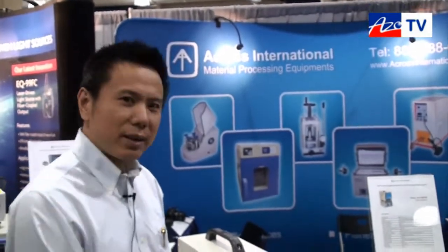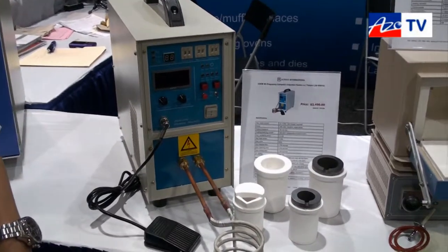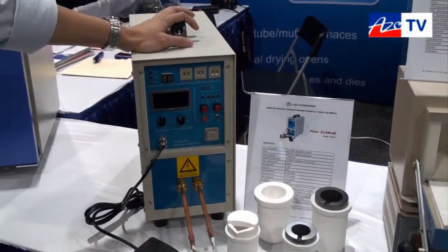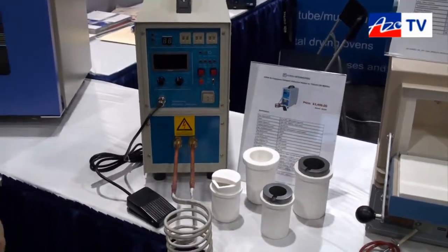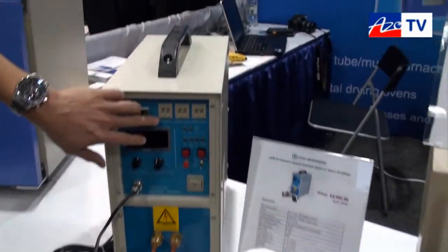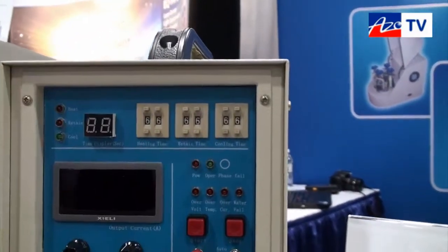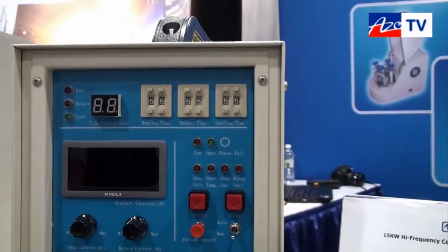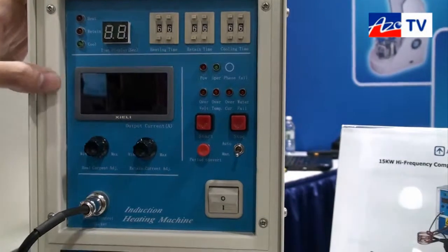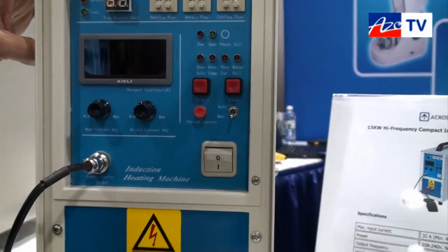This induction heater is for melting, welding, and surface heating. It's very compact, only takes 7kW input and the power input is 220V. There are three timers you can use to heat, retain, and cool the machine.